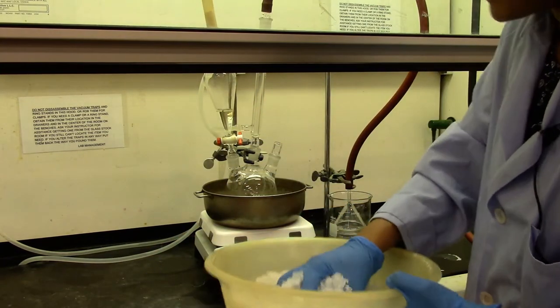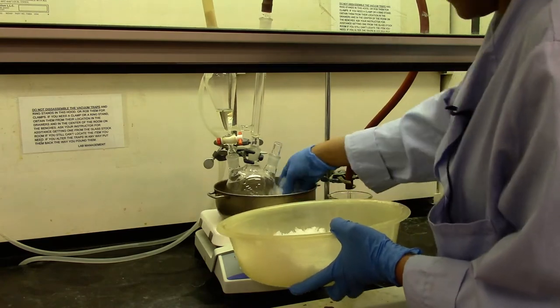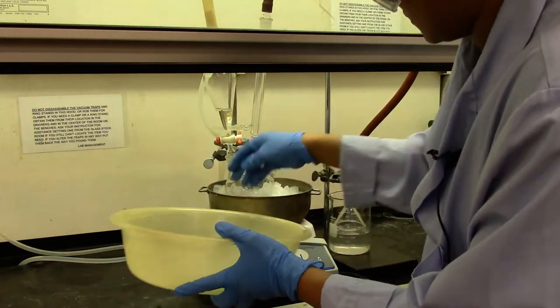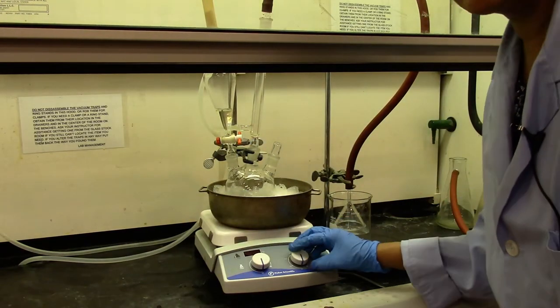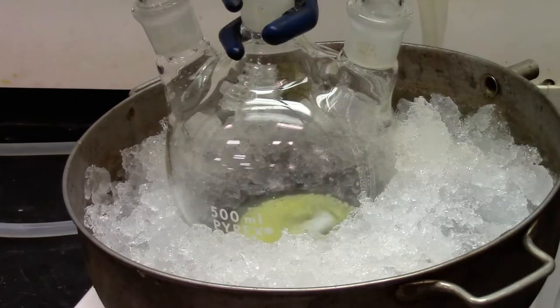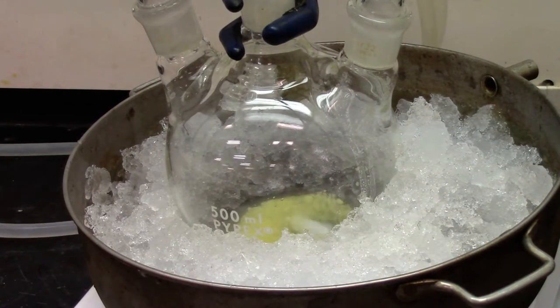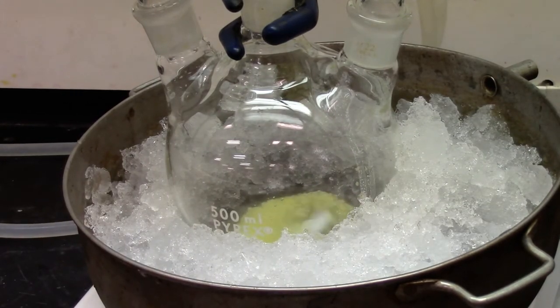I'm going to place some ice in my bath. And I'm going to start stirring the solution. We will stir until a fine suspension of aluminum chloride with the dichloromethane solvent has been formed.